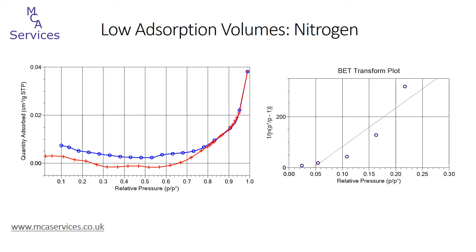To illustrate the problem of applying nitrogen adsorption to very low surface area samples, we've analyzed a low area polymer powder sample. The nitrogen adsorption-desorption isotherm is shown here on the left and we can see that adsorption volumes are very, very low. The isotherm is very irregular and it appears that the adsorption isotherm actually shows a decrease in volume between 0.1 and 0.5 relative pressure, which in reality just isn't possible.